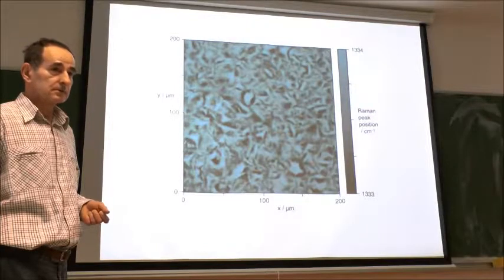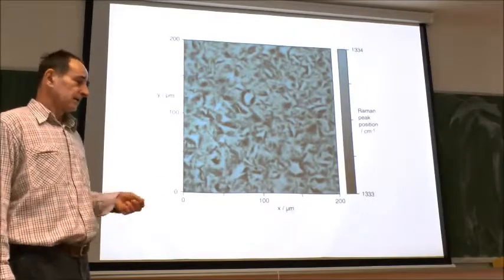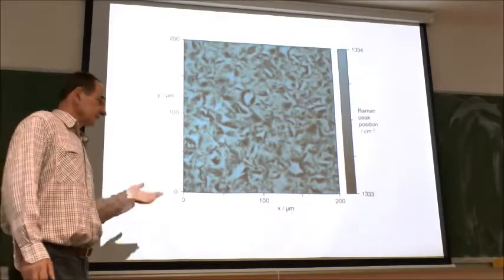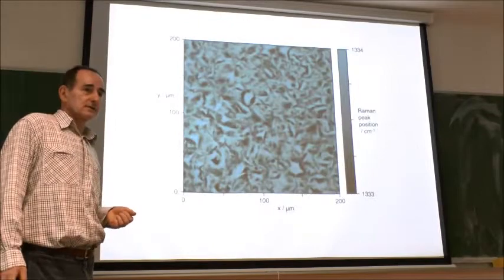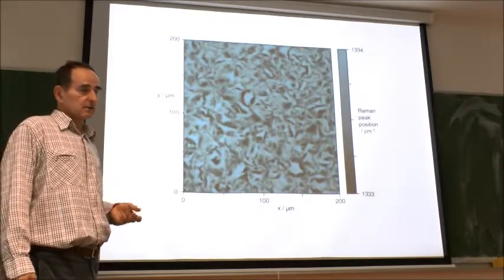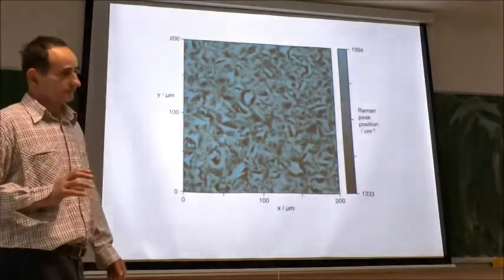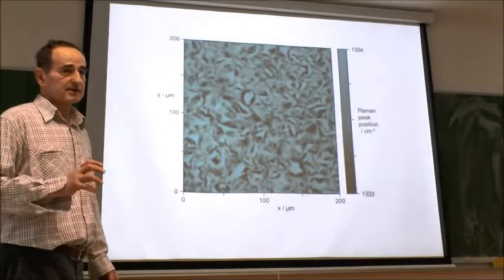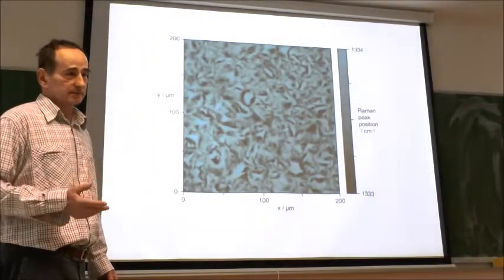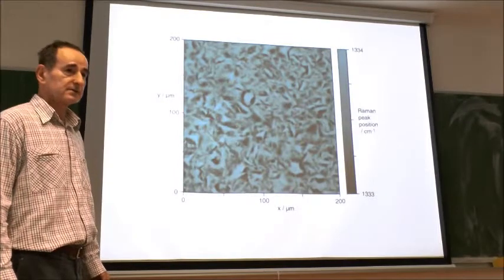Yes, please. I wonder how you can analyze anisotropic material. So you have some polarizers for the laser or the scattered light. I didn't mention that there is of course a polarizer and analyzer, and always automatic. Also you can turn the polarizing light by a fraction, I think 5 degrees or something like that.